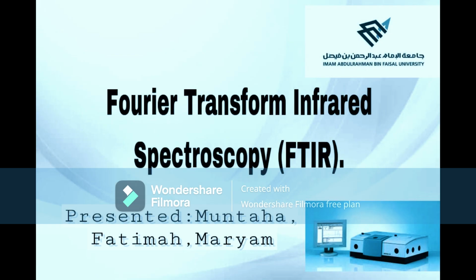Hello, today we will be introducing Fourier Transform Infrared Spectroscopy, FTIR. We will be addressing the basics with the infrared region, infrared spectroscopy, what is FTIR from a practical standpoint, and its analysis and sample preparation.